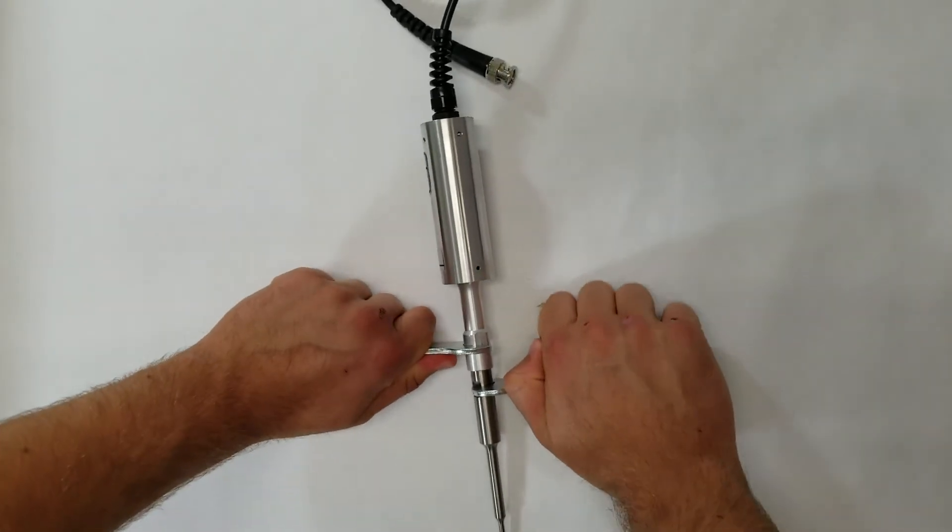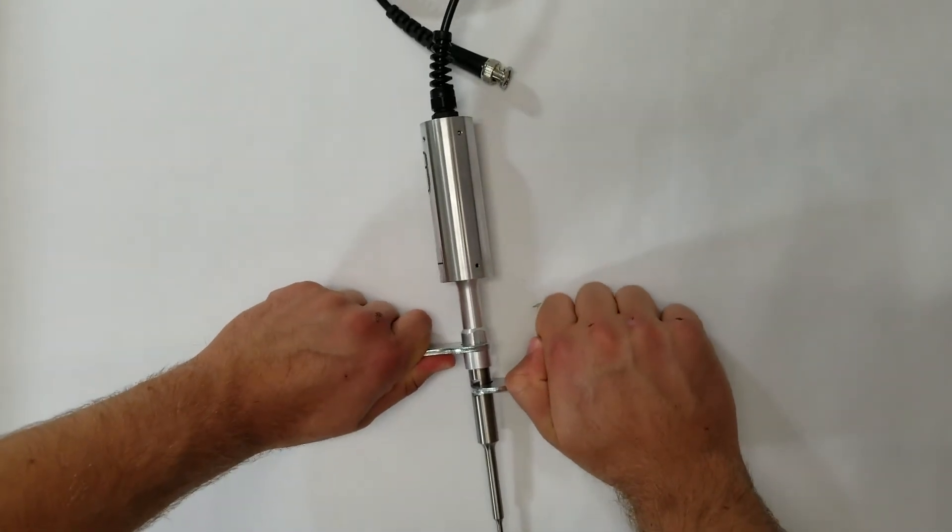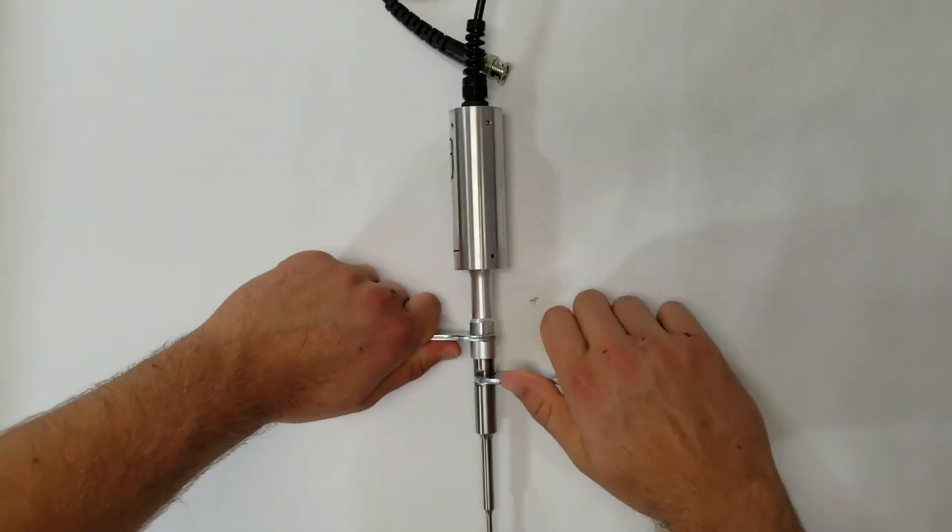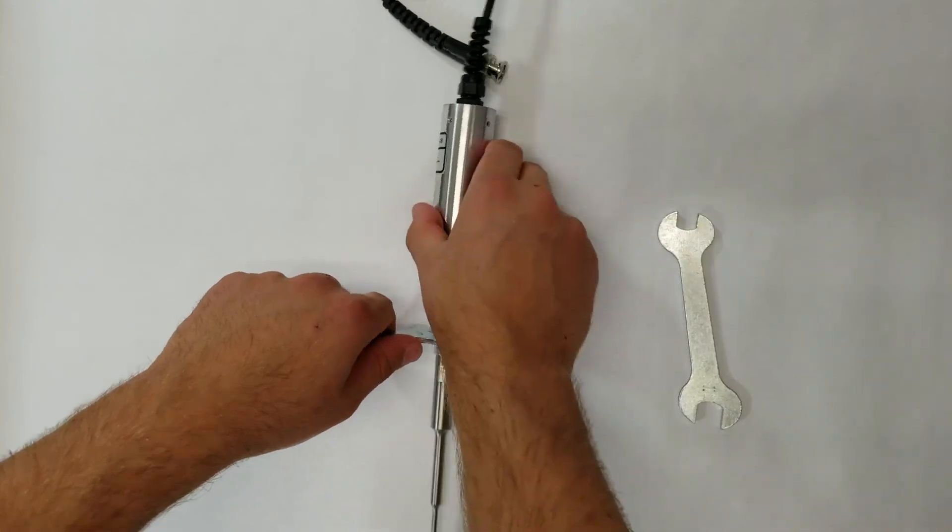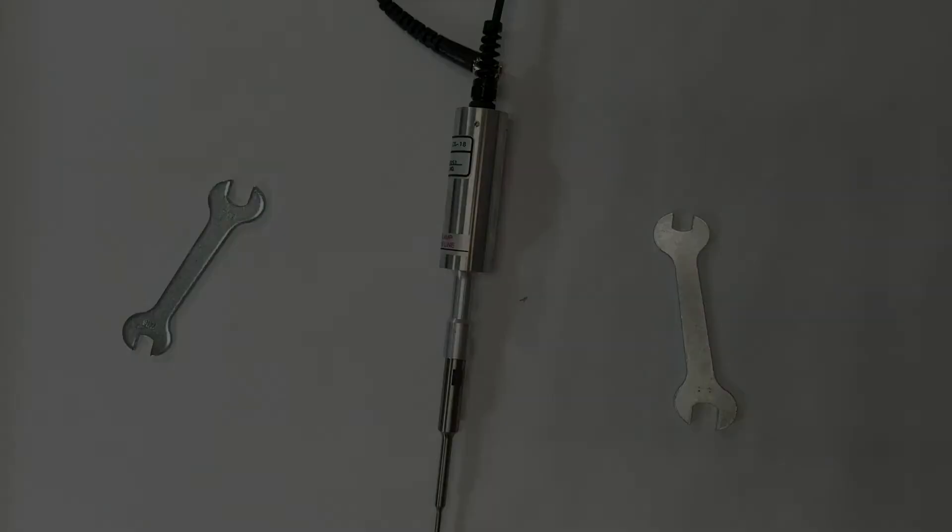Tighten the assembly as hard as you can. You won't break the components. Now the assembly is ready to be connected to the power supply.